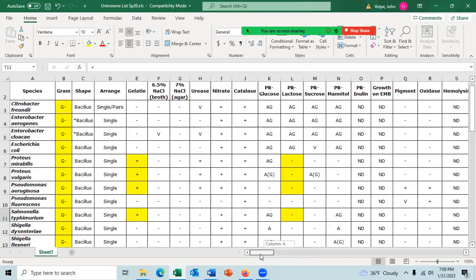Let me state that when you're looking at this table, I think it's obvious what positive and negative are, meaning the test is positive, the test is negative. What does the V mean? A V means that the results could be variable. That means, in this case, if we had something that was positive, we'd have to take those, and we have to include all of these variables, because the variable could be positive, but the variable could be negative. So we cannot rule these out. Any questions about a variable result?